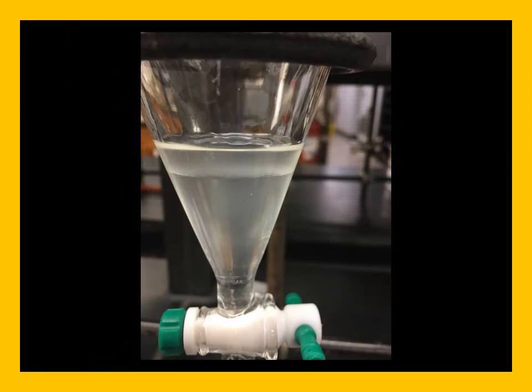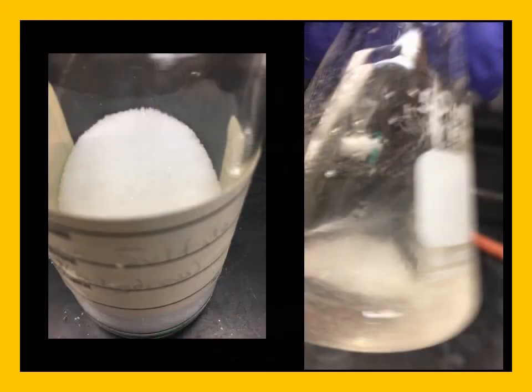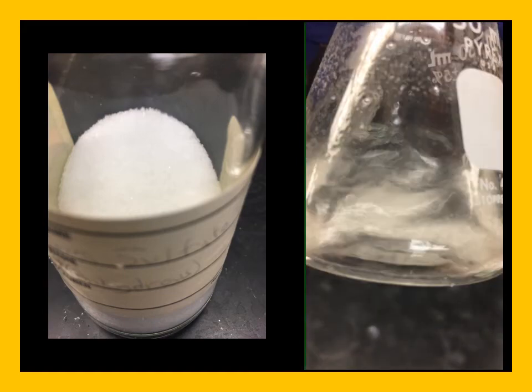We can now see the two layers. We're going to drain our lower organic layer. And now we're going to dry this with sodium sulfate. On the video, you can see swirling to make sure that the sodium sulfate has completely dried the solution.